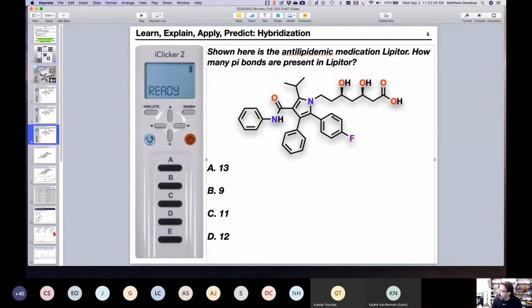So this carbon here and that carbon there, acid versus amide, we will resolve them using carbon NMR. They will occur at different chemical shifts. So we can know, okay, it's in this region, it has to be an acid. It's in this region, it has to be an amide. So what am I getting at here?